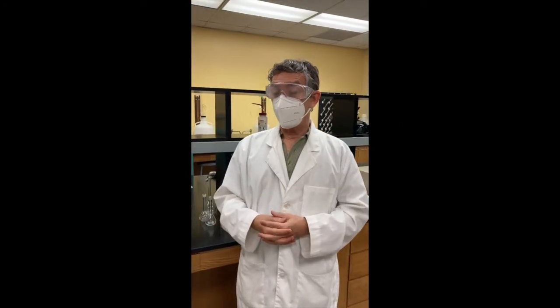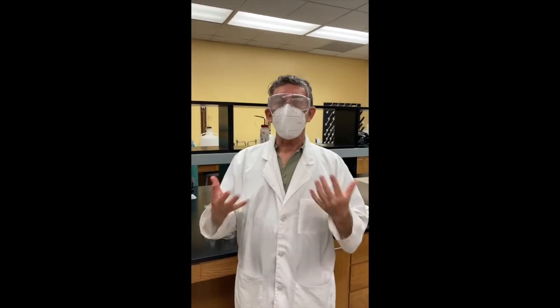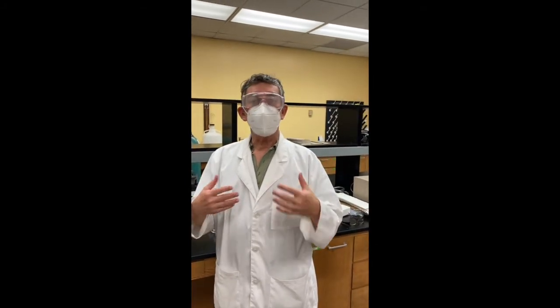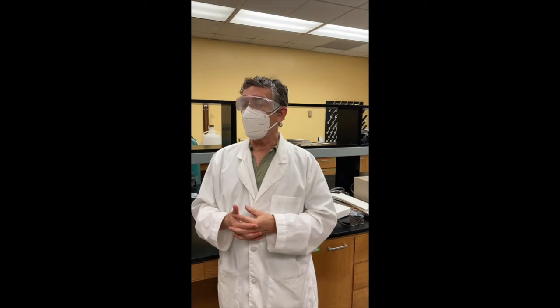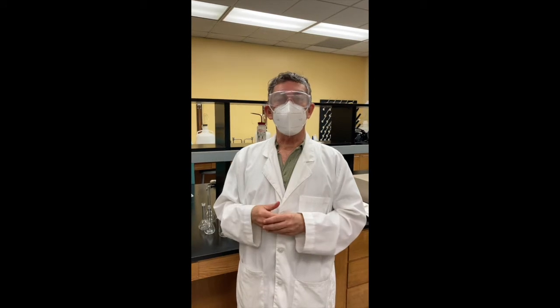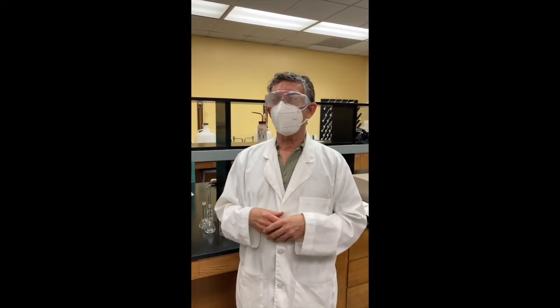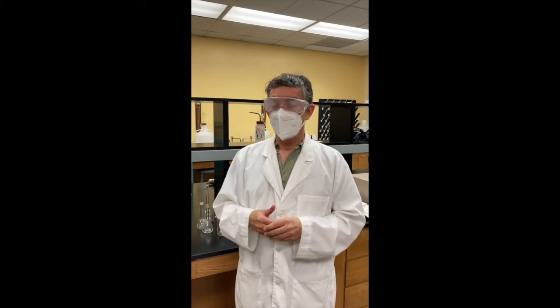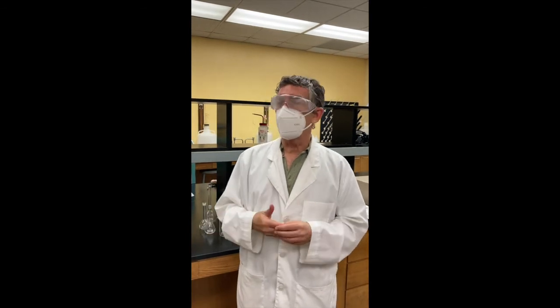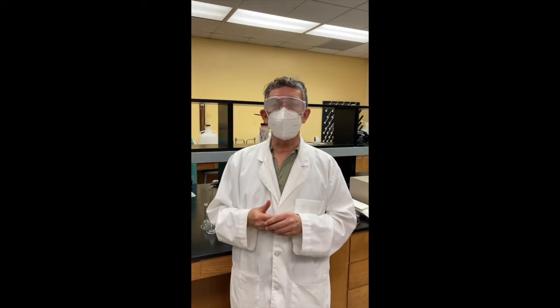So I want to tell you now about the process of carrying out this experiment, the viscosity and molecular weight of polyvinyl alcohol. You may have already seen the theoretical calculations intro, but just to frame what we're doing. So we want to characterize a polymer. In this case, it's polyvinyl alcohol. And this is important because polymer chemistry is a major thing, important for industry. And characterizing polymers is an important thing for their properties, especially their physical properties.